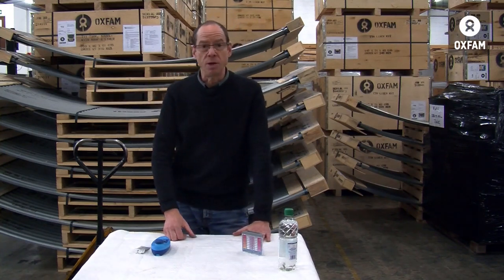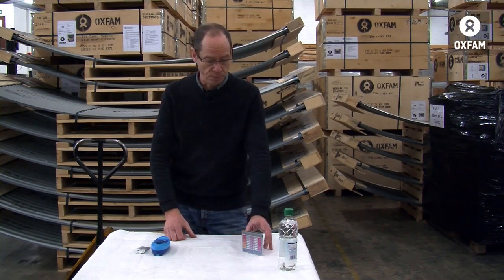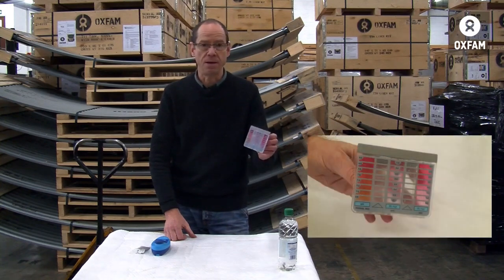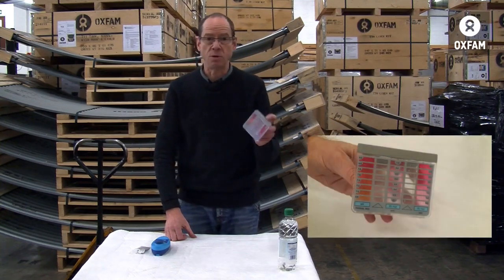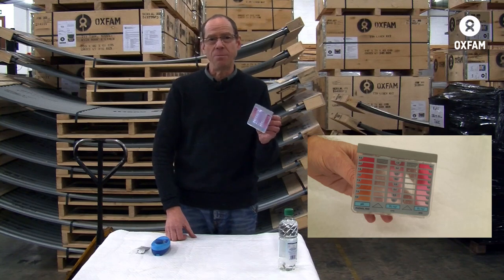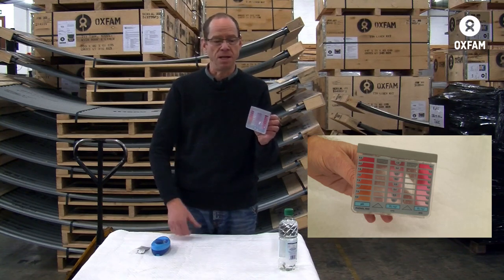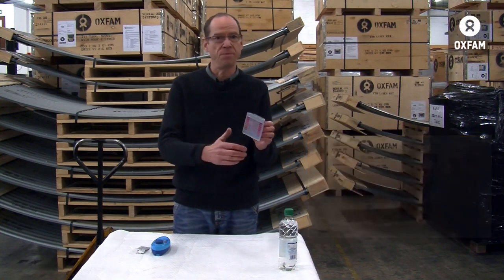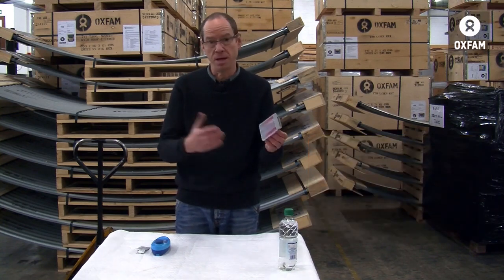There are a number of ways of doing it, but there's two ways I'm going to show you today. One is the simple method using the Pooltester kit, which is a colour comparator. Very cheap, the kit's about £12, very easy to use, you can do this very quickly, but the results are always a little ambiguous or subjective because they rely on the colour comparison made by the person who's using it, which may not always be the same as someone else.